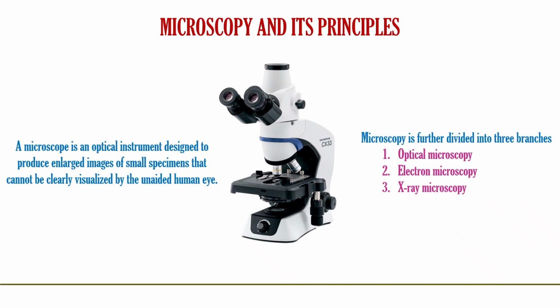In the case of electron and X-ray microscopes, an electron beam is created which produces a digital magnified image of an object. The magnification of these microscopes depends on the type of lens used in the system, which produces images of different magnitude and resolution so that they can be viewed. Microscopy is important in different areas of science like histology, cytology, and bacteriology.